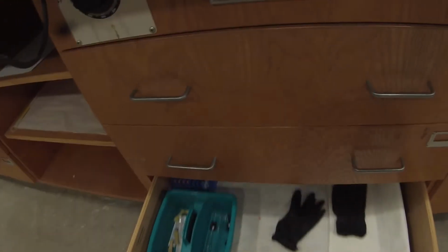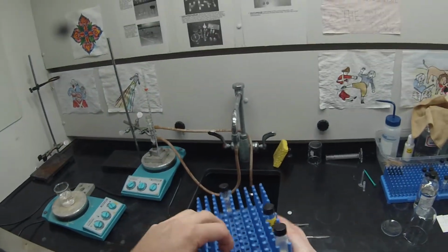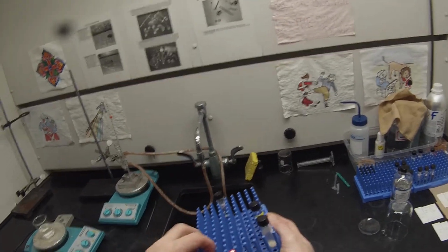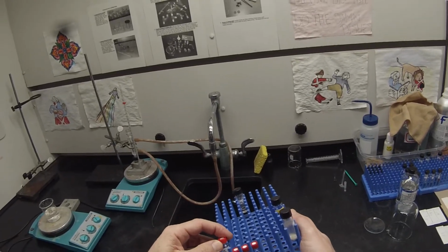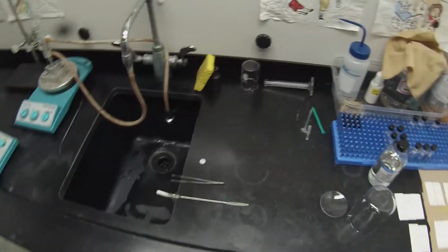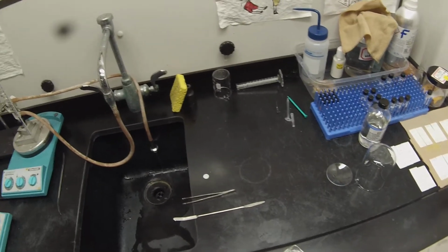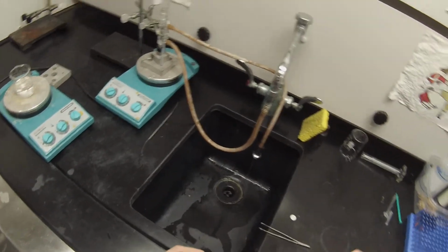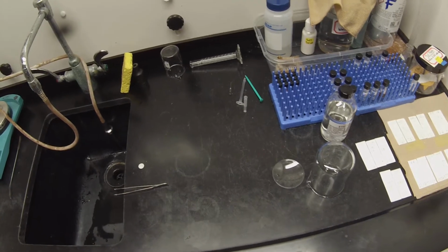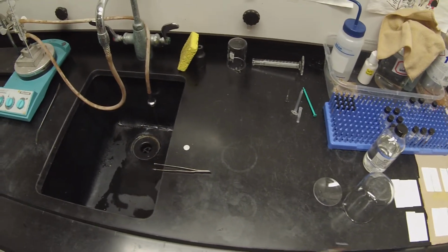I have labeled some vials. So I have 49A here, and I have 49B, which will be the recrystallized material. I also have 48A, and I have a 49C in case we want to take a mass spec on the filtrate. So 49A, which is this solid here, need a small amount for a mass spec sample. So I'm just going to take a little bit of that solid using the other end, the thin end of the spatula. Doesn't take much for mass spec. So I'm just going to take a little bit of that solid.